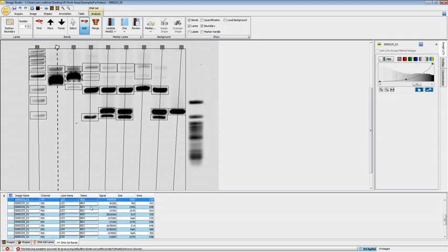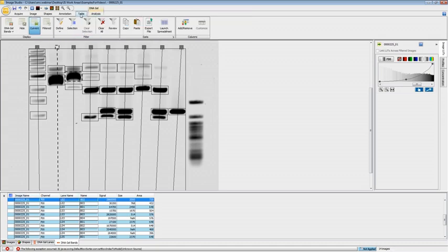And when you want to export this, I'll be covering that in a later video for the tables ribbon, and image export will be covered under the application button ribbon a little later on.